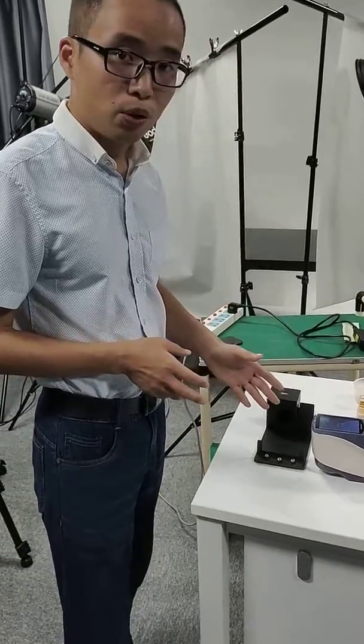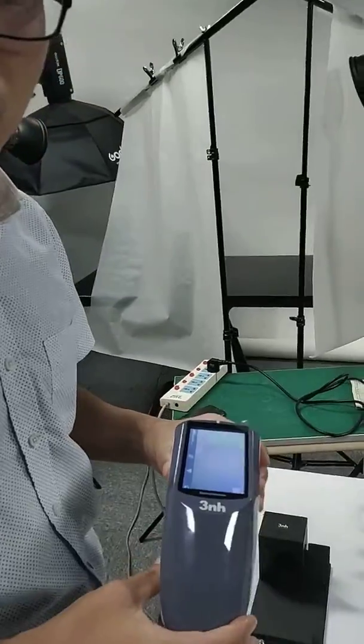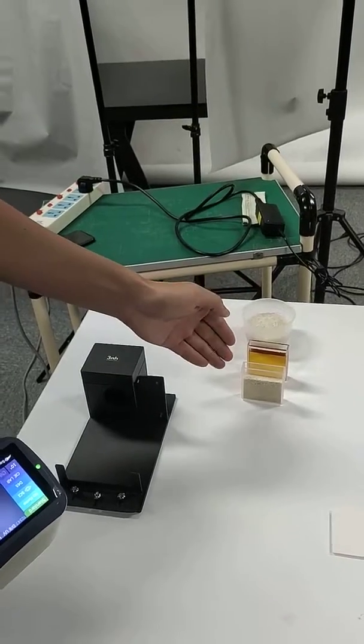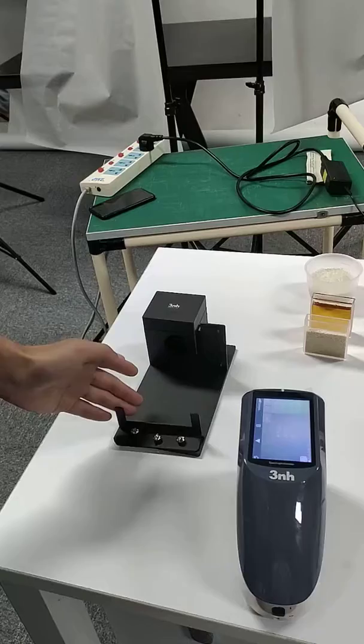Here I'm going to show you how to use our YS3060 portable spectrophotometer to measure the color of liquids and powder with a universal test component.